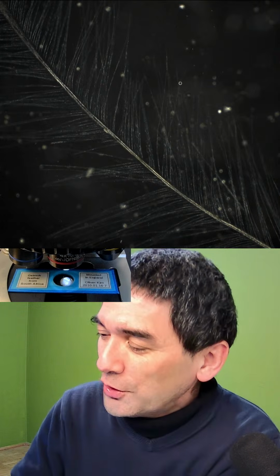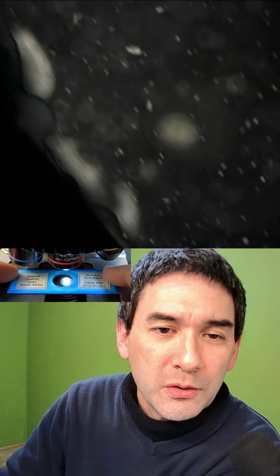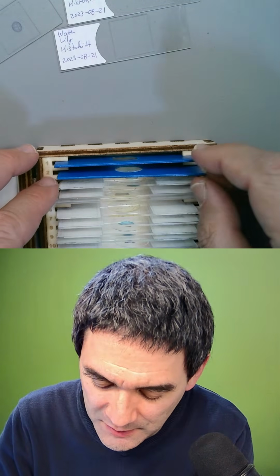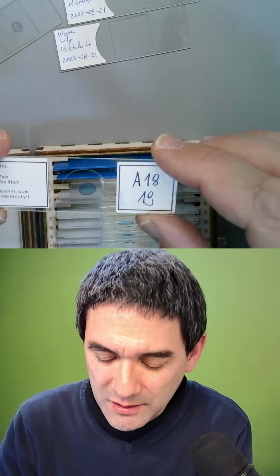So the ostrich feather is a nice one as well, also mostly sentimental value for me. And now let's move over to some of the commercially prepared slides. And they essentially are kind of expensive, some of them.